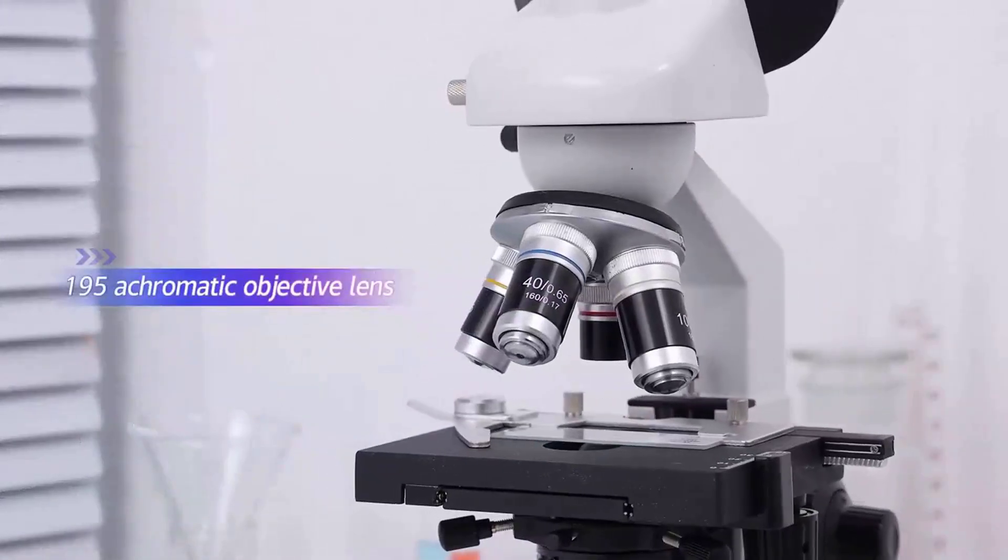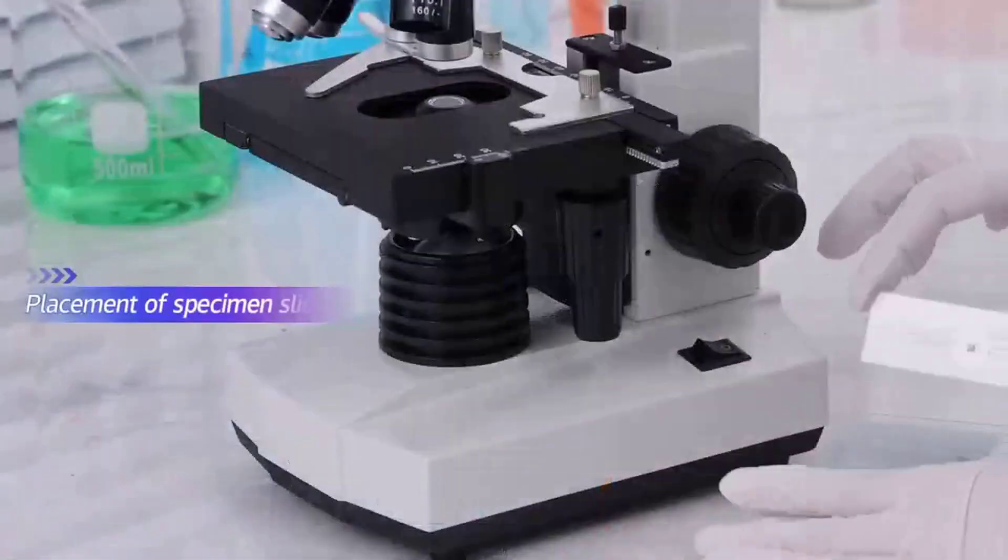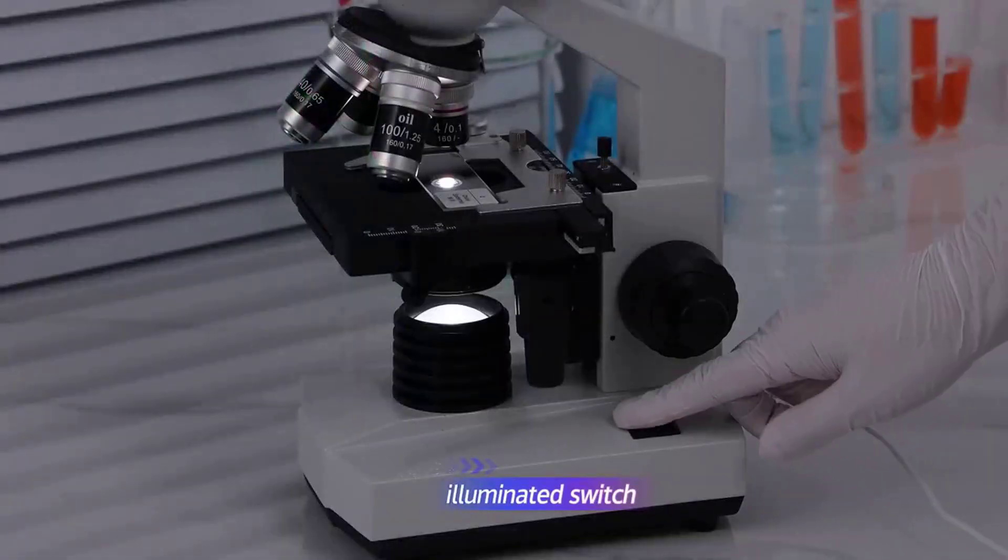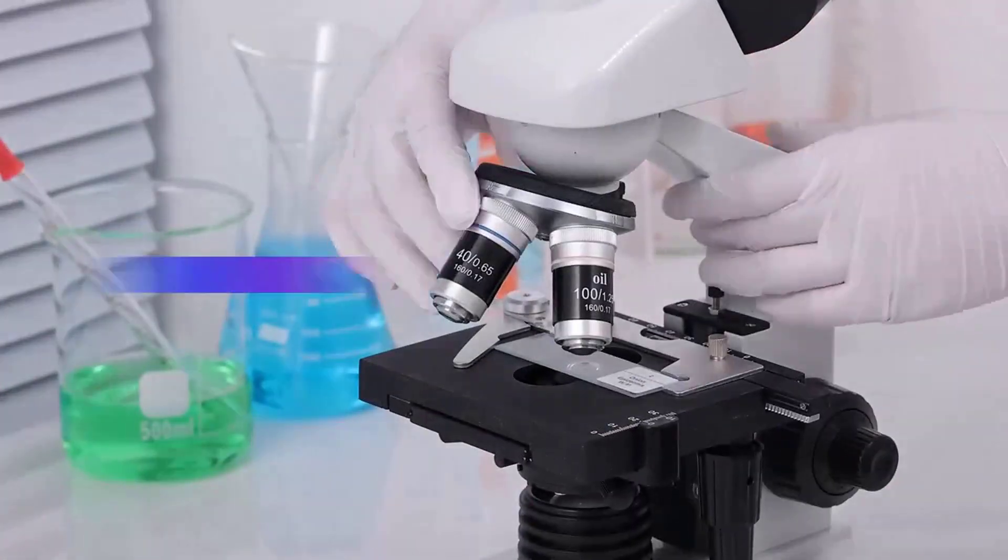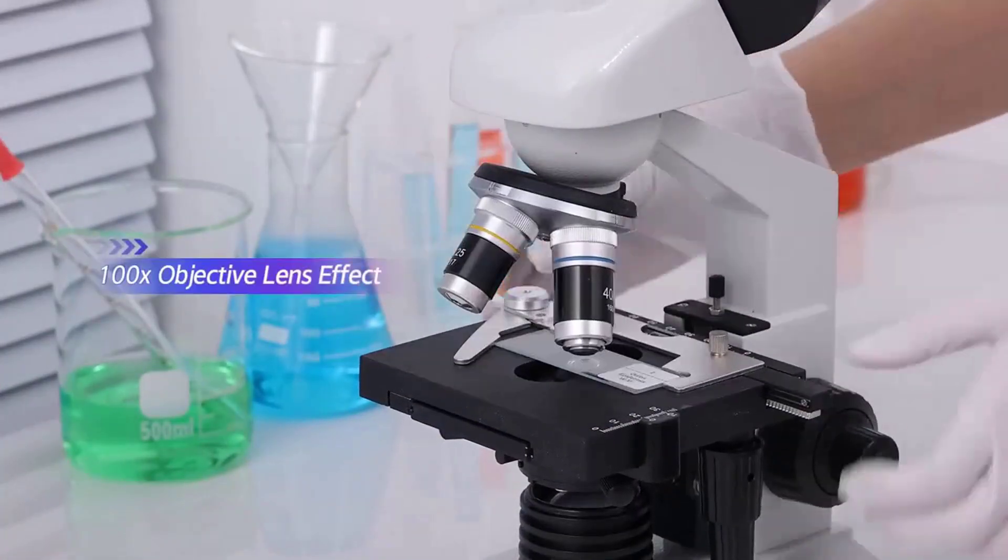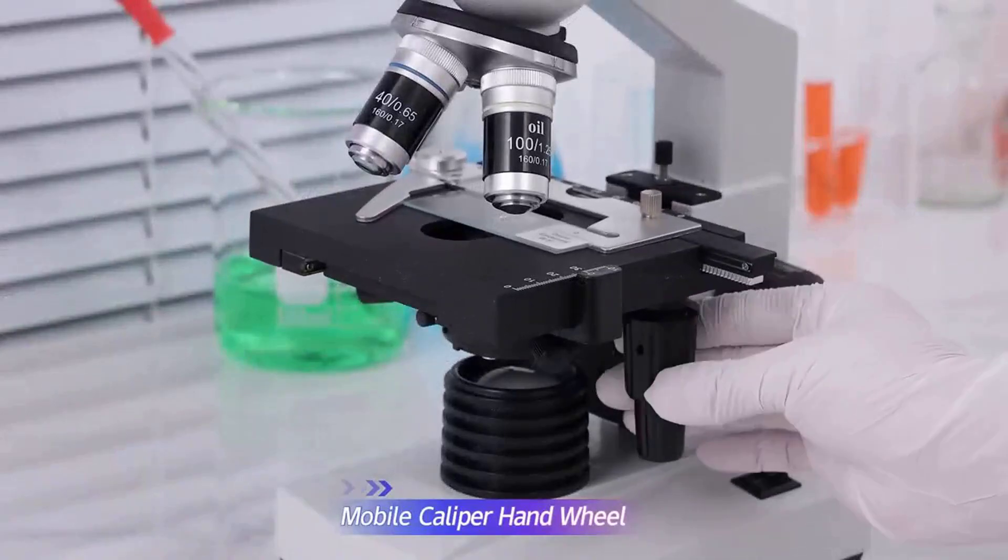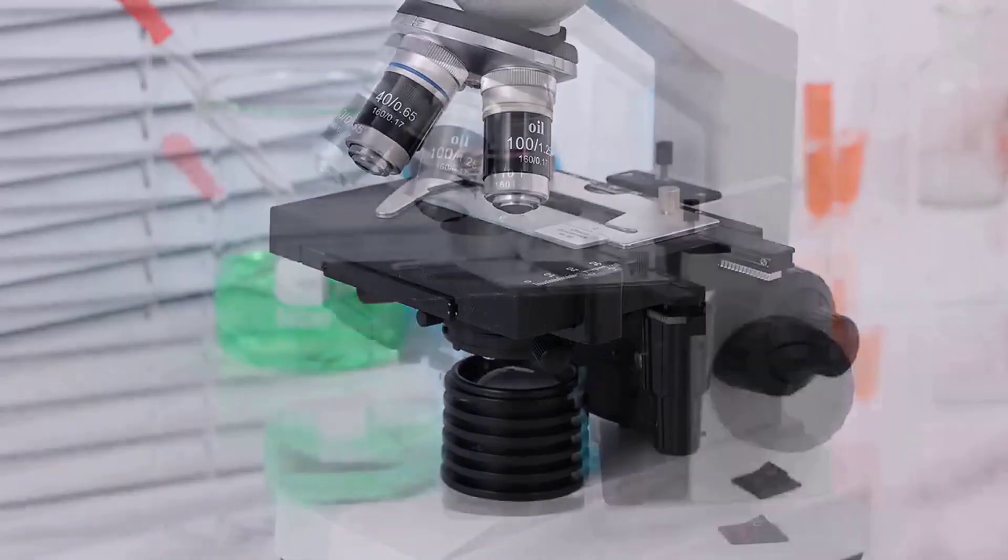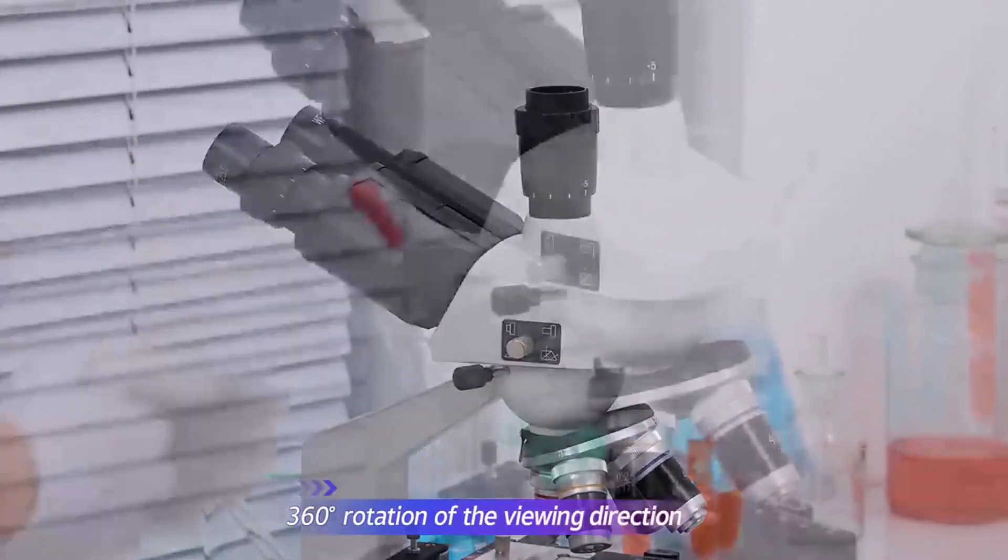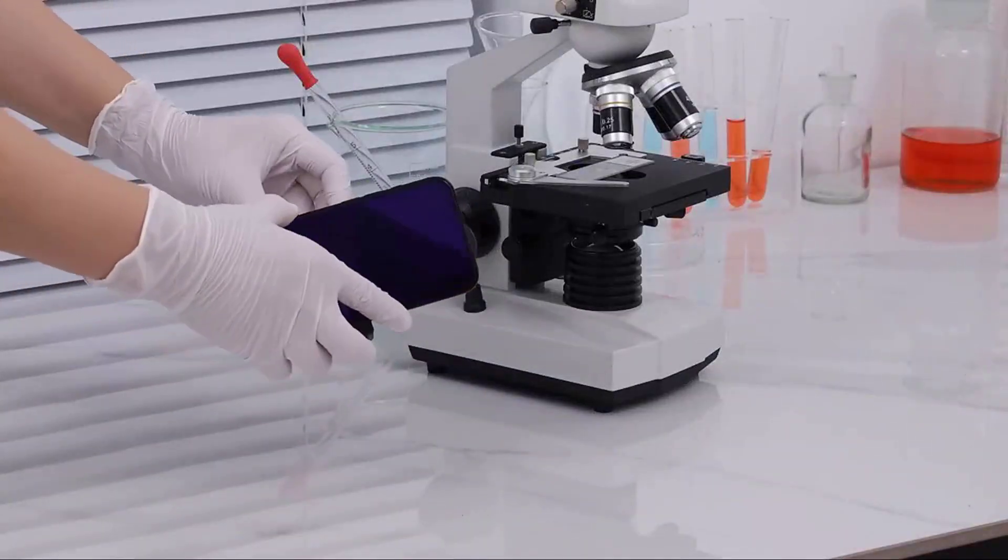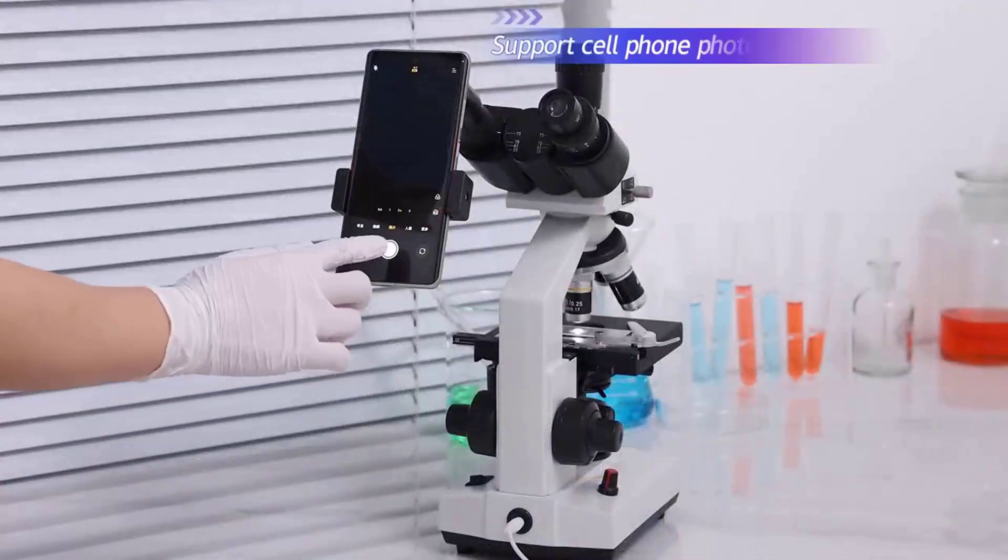What distinguishes this microscope is its superior accessory collection. Unlike basic packages with mediocre supplements, this kit provides high-quality slides, Petri dishes, and essential laboratory tools. When compared to models limited to 2000x magnification, the Wohirsch delivers substantially more powerful viewing capabilities. While those alternatives excel for entry-level use, this microscope addresses more sophisticated requirements. The premium optical components and professional-grade accessories validate its price point, making it an ideal choice for serious laboratory applications or dedicated enthusiasts demanding superior image quality. This instrument excels in delivering professional-grade performance.